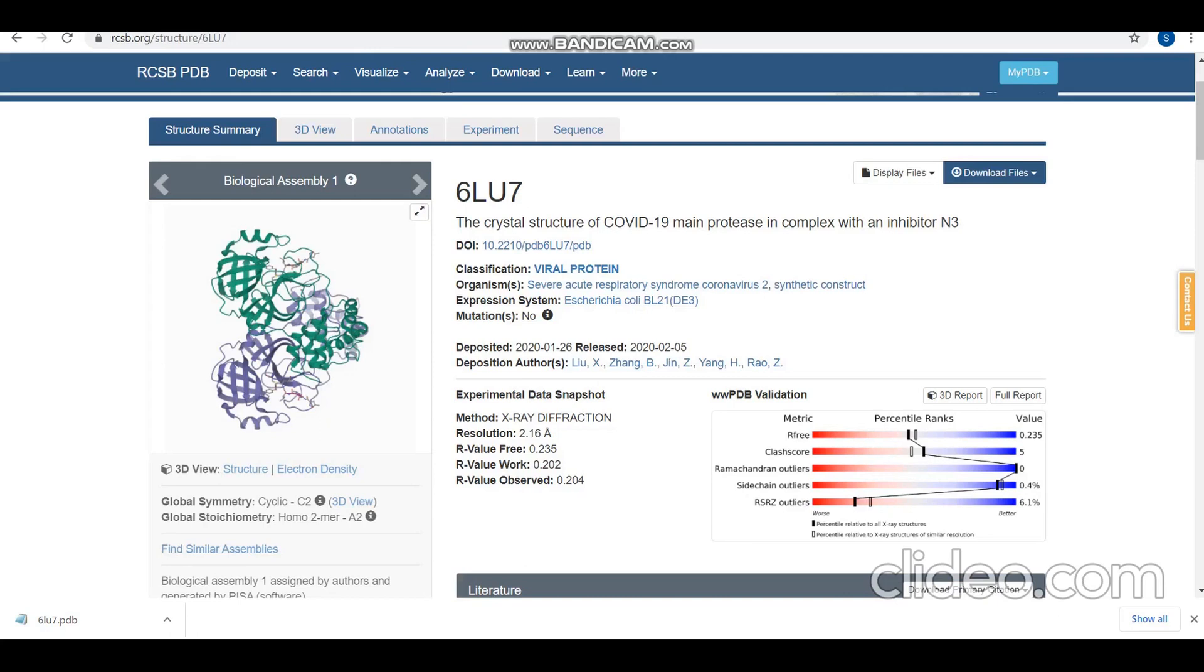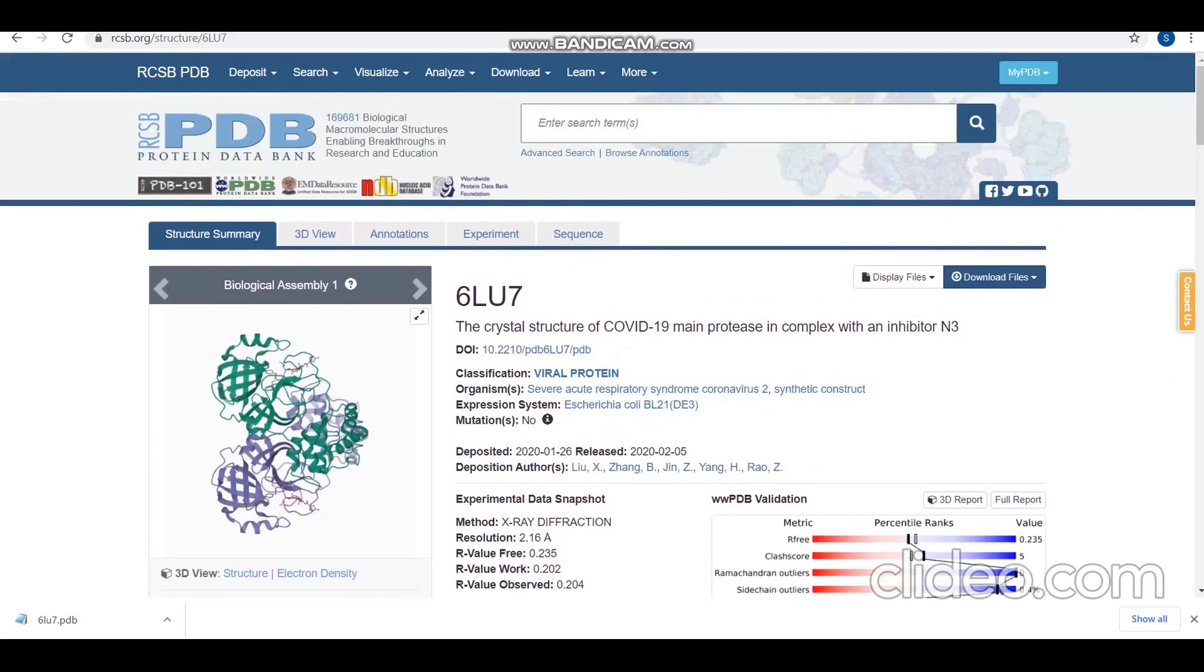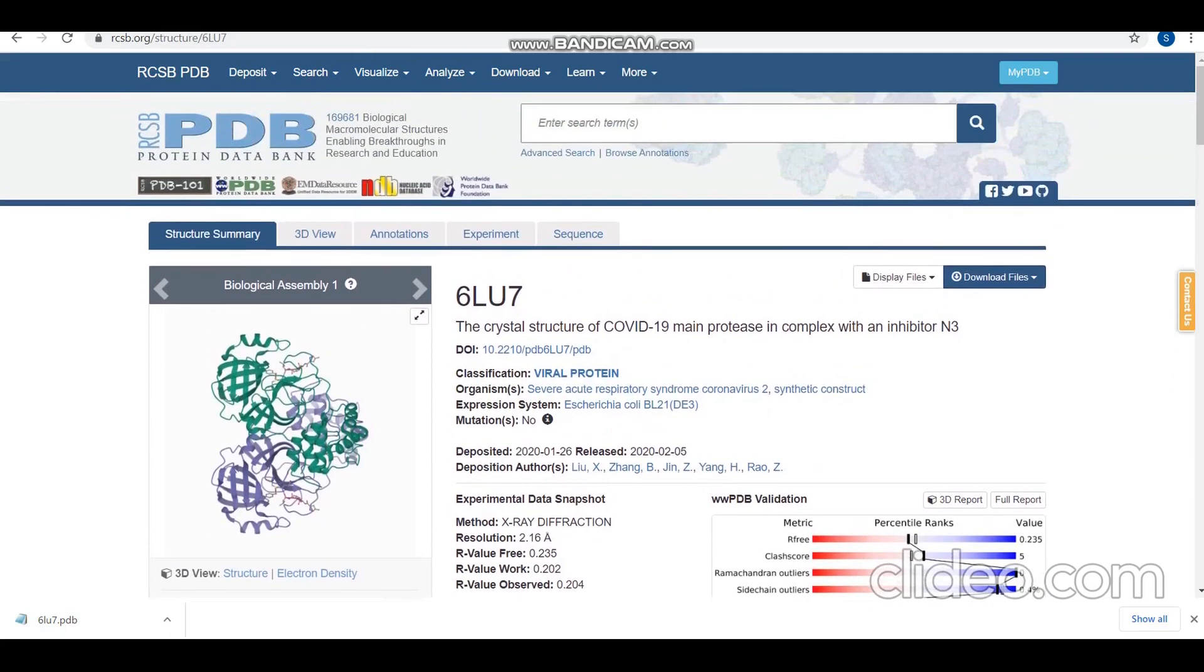The first thing we need to do is download the protein structure. I'll be downloading the crystal structure of COVID-19 main protease which is in complex with an inhibitor from the Protein Data Bank.